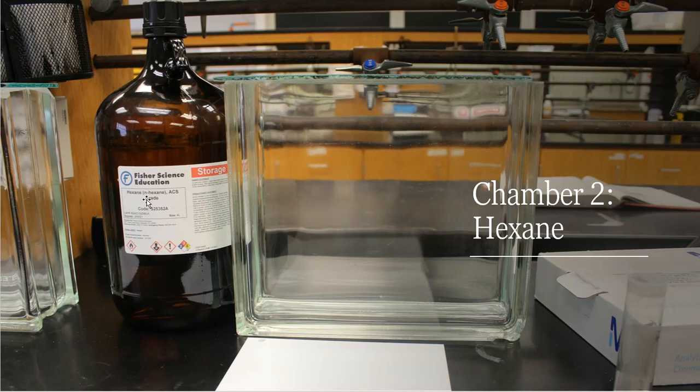All right, here's chamber number two. So chamber number two has nothing but hexane in it. That's it. So again, 20 to 30 milliliters of hexane here in the bottom. And then I put the lid on top and I let that equilibrate before I begin to use it.